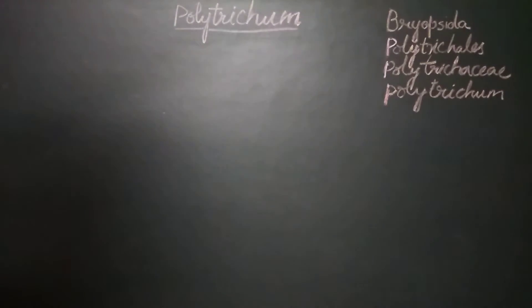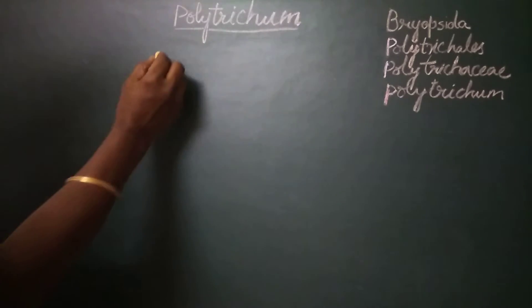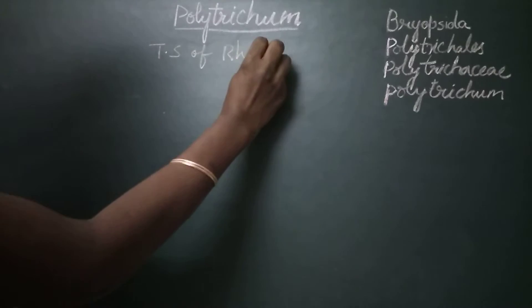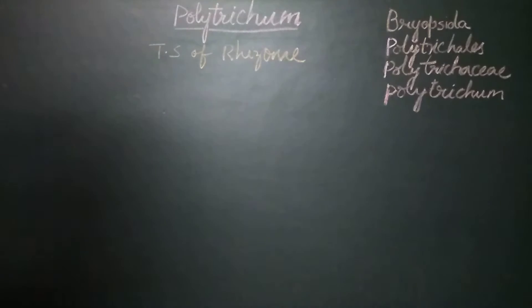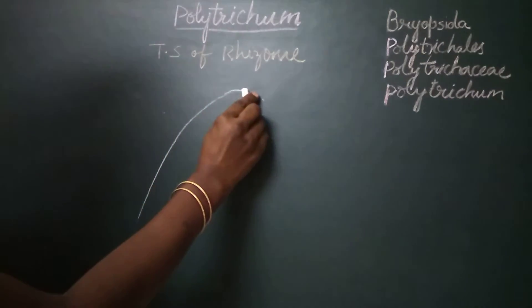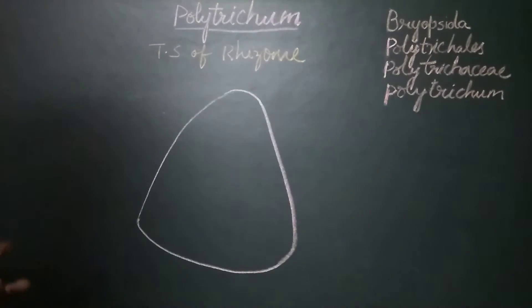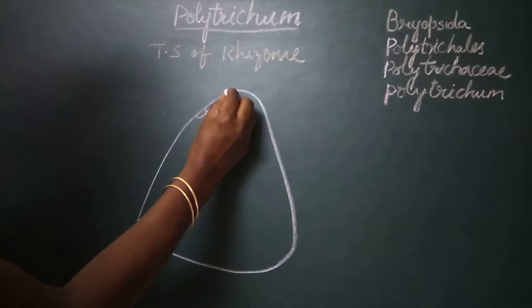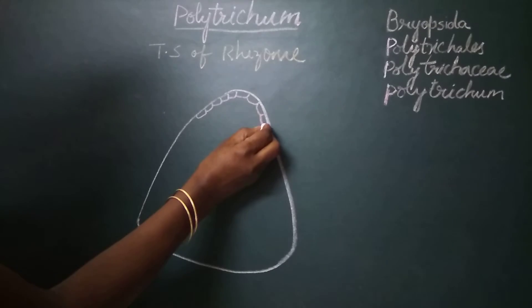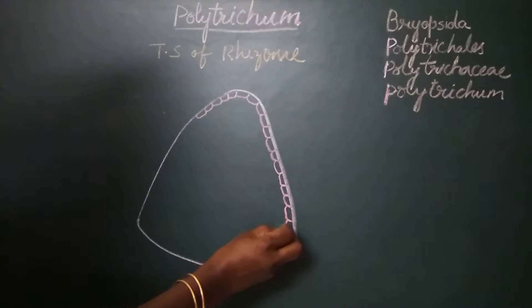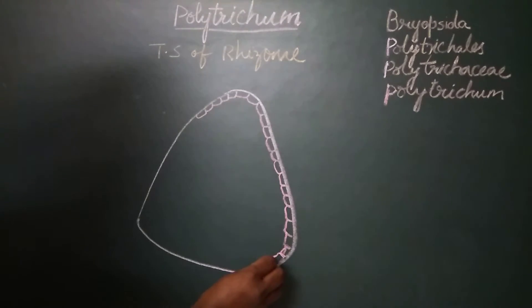Let us see the internal structure of the rhizome of Polytrichum. This we can study well under the transverse section. The transverse section of the rhizome of Polytrichum is roughly triangular in its outline and shows the outermost layer, which is the epidermis. The epidermis is made up of small rectangular cells which have thick walls.